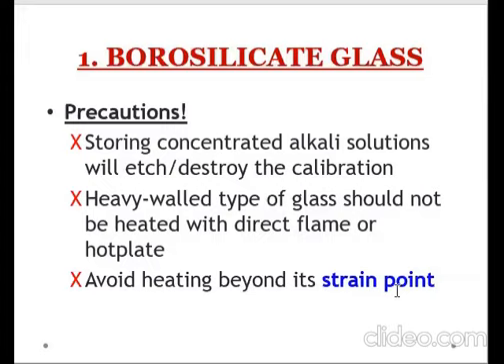So, what do we mean when we say strain point? When we say strain point po, it is defined as the temperature at which a certain glass viscosity is reached. In other words, para mas madaling maintindihan, kapag sinabi po nating strain point, it is the point at which all movement of the glass molecules has reached a point where no more strain can be introduced to the hot glass. Kasi po, kapag nilampasan mo yung strain point, siguradong masisira na yung glass. Either mag-break siya, mag-crack siya, or mag-melt siya.